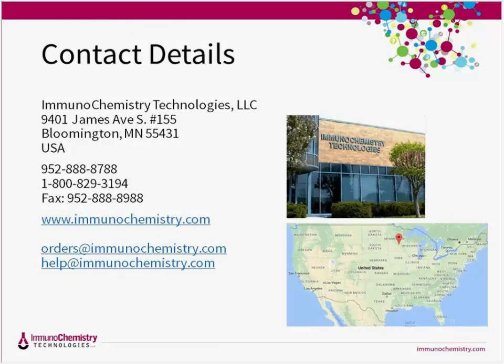Well, it's generally understood that mammalian origin caspases are quite highly conserved in terms of their ability to react with their respective optimal caspase targeting amino acid sequences for these different caspase enzyme types. We have personally not encountered any circumstances where there were specificity differences between, say, a human-derived caspase versus an analogous caspase type from another animal genome, such as a mouse. So therefore, to the best of our knowledge, our FLICA products are species independent and should work well in a variety of different species.